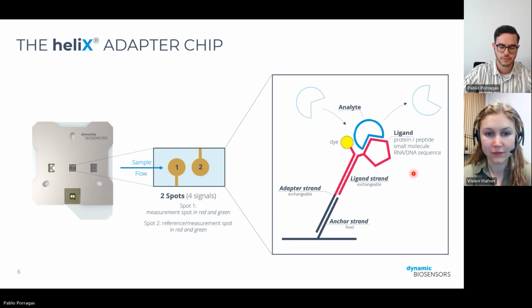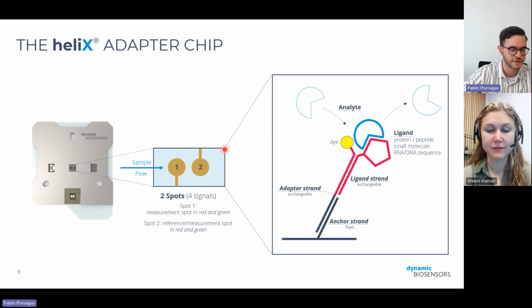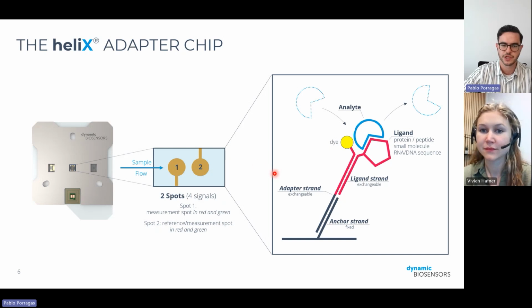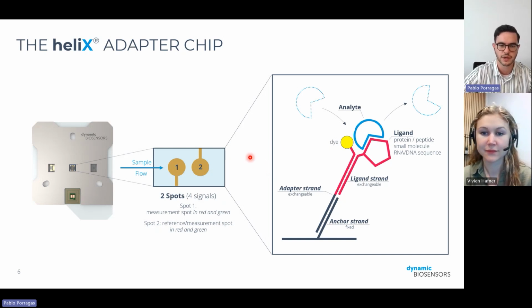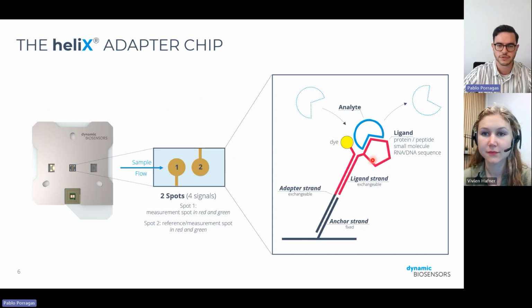And so the click chemistry is with some kind of reactive side chain of an amino acid on the exterior of the protein. Right. So we can do a variety of different conjugations. We can do maleimide coupling, or just standard amine coupling. We really have a variety of different ways that we can do this, and it works quite well.